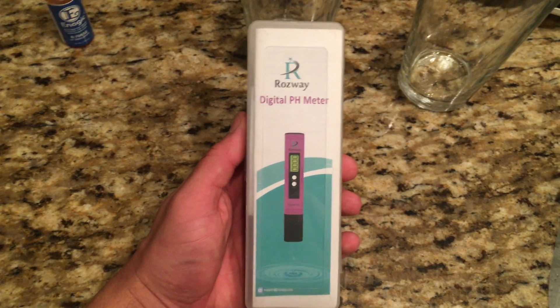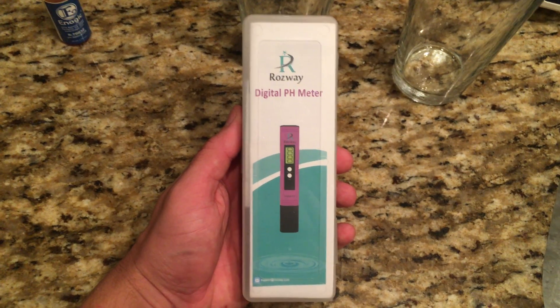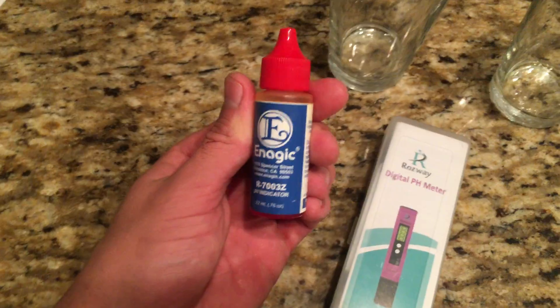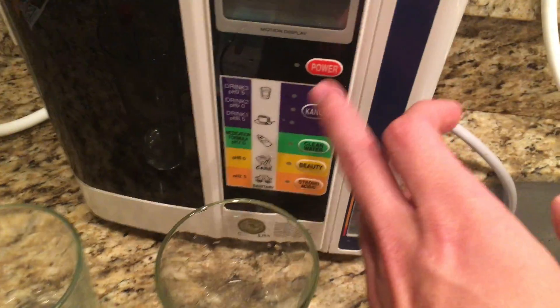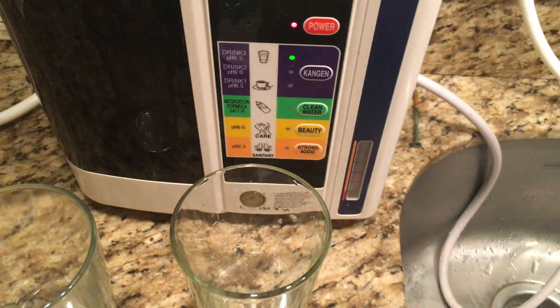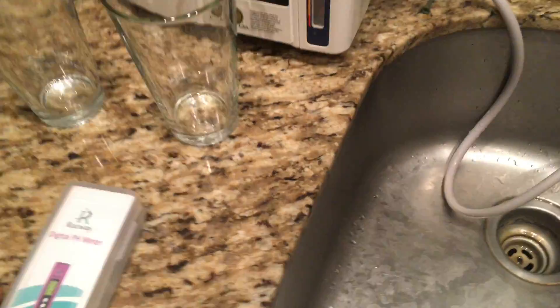We are going to do a quick review of the Rossway digital pH meter. I have some pH drops that we're going to compare it to. I have a Kangen water machine where we can change the alkalinity of the water. So we're gonna get started first.